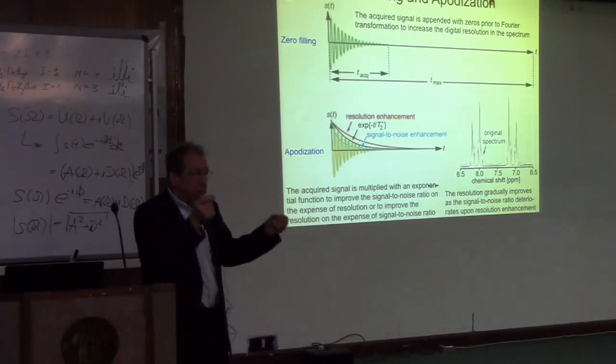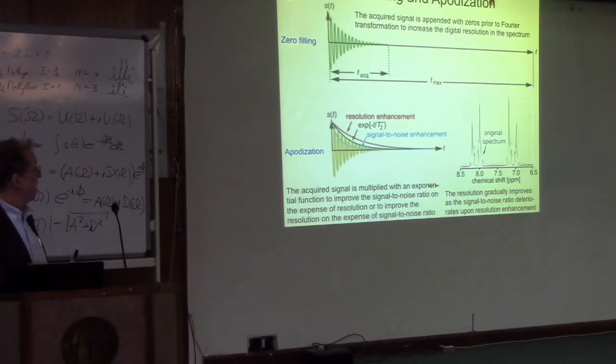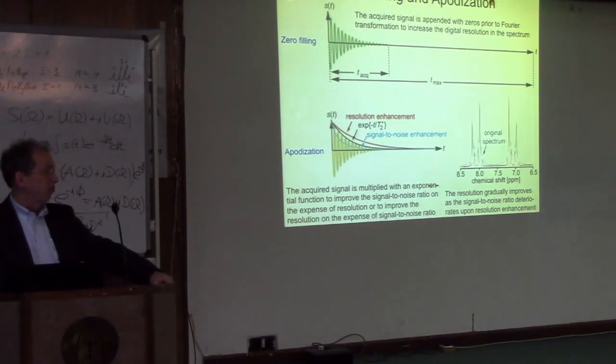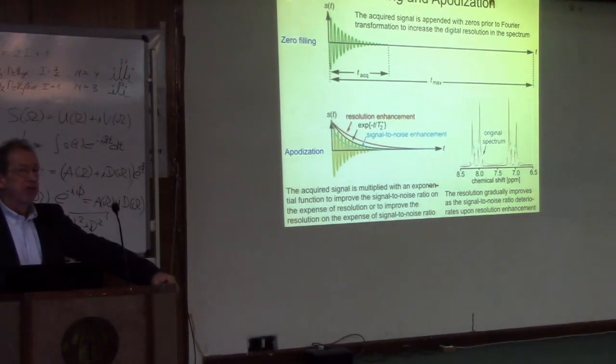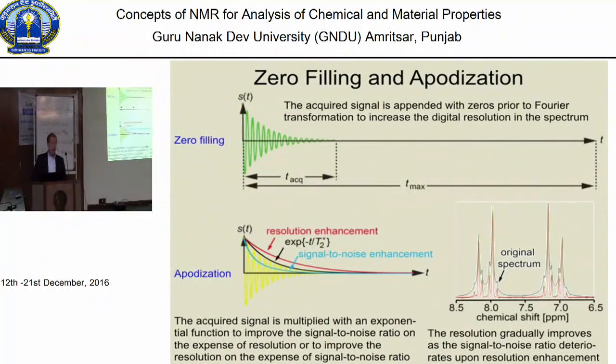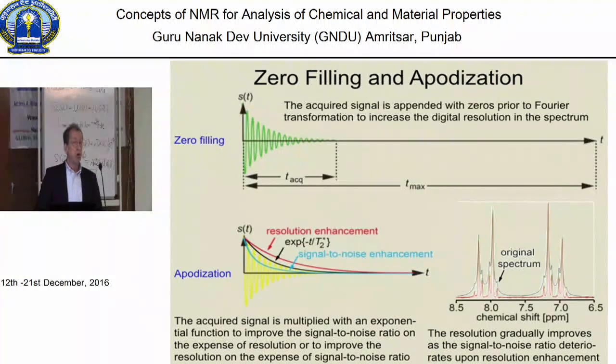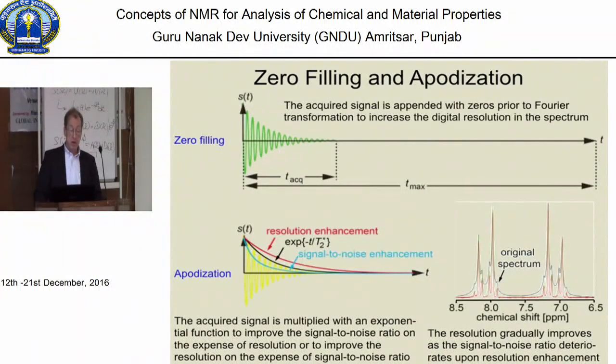So these are tricks a little bit advanced, which one plays at the spectrometer. And sometimes when you buy a new spectrometer and you have several manufacturers that compete, we used to do that when we still had several manufacturers for high resolution spectrometers, like Bruker and Varian. They would play these tricks on you, and then you would have to ask exactly, put your sample there, measure the spectrum, and then show me while you process the data, so that you're not being tricked. So these are games one can play, and they're actually quite helpful when you have a complicated case to analyze. Your signal to noise is not good enough, or it is so good that you can actually enhance the resolution. You can play these games.